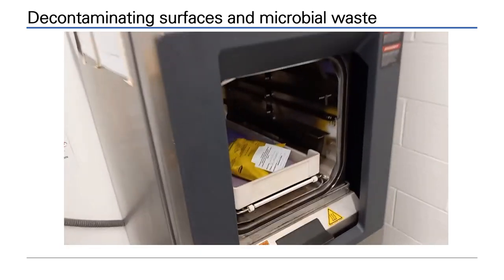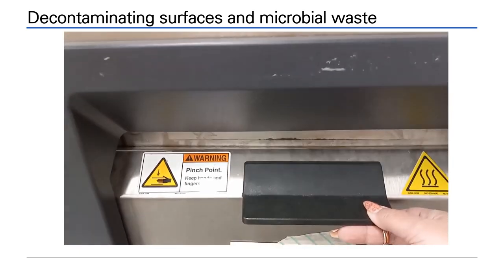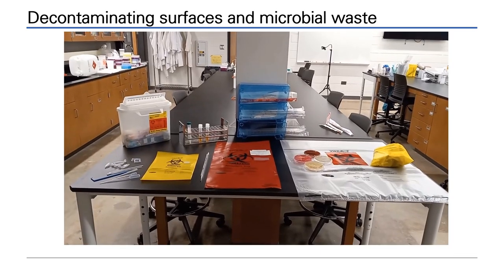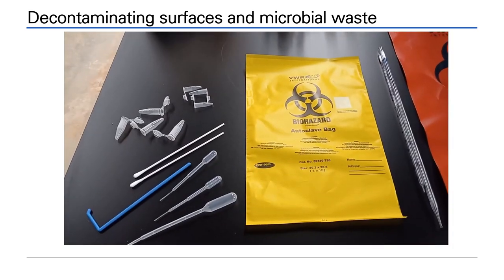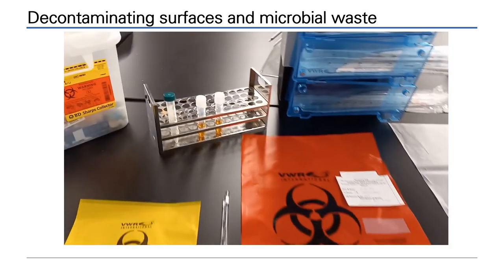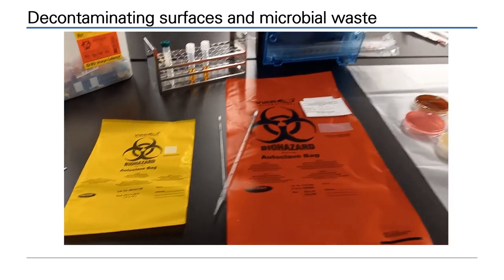This industrial autoclave has a large chamber. All the waste is placed in a tray, labelled, and sealed with autoclave tape. The autoclave will be set for 20 minutes sterilization at 121 degrees centigrade. All waste must be bagged before autoclaving. Examples in the video show the types of waste that will be put in each type of autoclave bag.